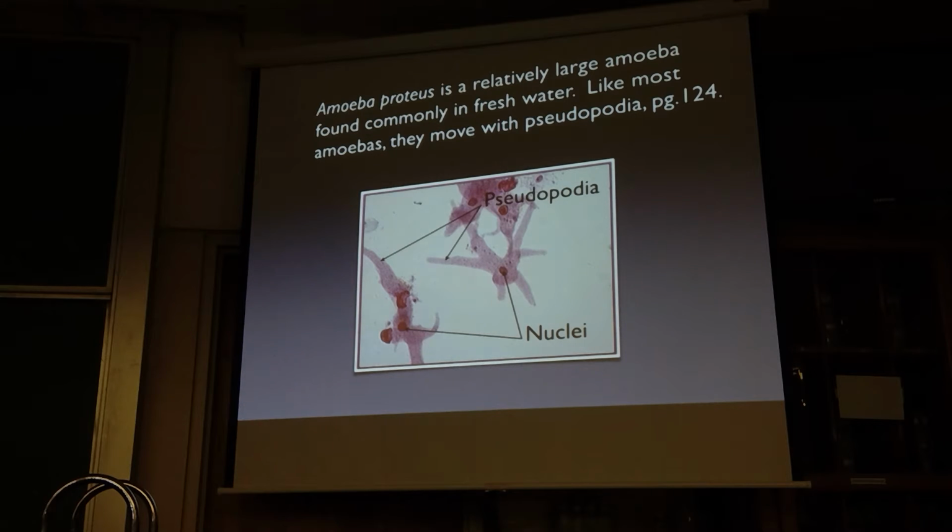They're all artificially colored. So somebody took the time to make a batch of amoeba, stain them one color, another batch of amoeba, stain them another color, and they made all these different colors and then put them together. So they're just a mix. Just to remind you, remember our cheek cells, they were blue, purple, or pink. It was dependent on the stain. That color is artificial.